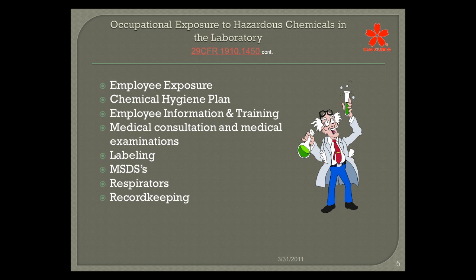and then you have to talk about when you work with hazardous substances, which include carcinogens, reproductive toxins, and substances that have a high degree of toxicity, such as chromic acid. That has a high degree of acute toxicity. Then you have to discuss where you're going to be working with these, what type of work practices you're going to use, and then how you're going to handle your hazardous waste, and then if you do have a chemical spill, how you're going to decontaminate and mitigate and control that spill. So it's a lot of information that's actually required in a chemical hygiene plan.